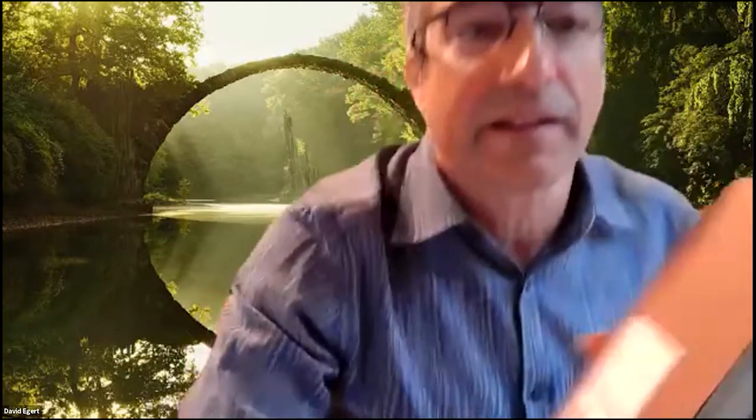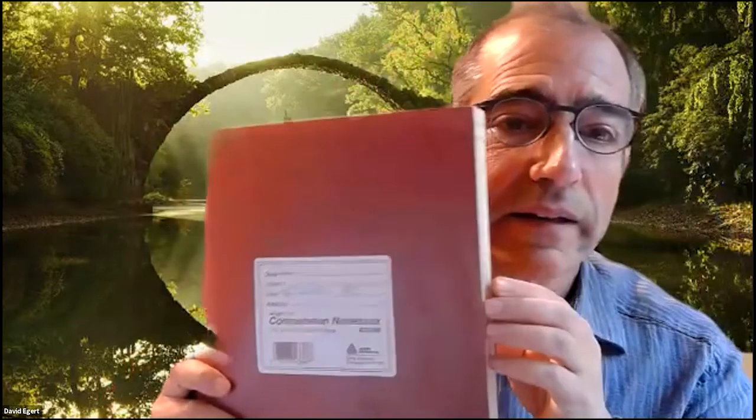All right, this is a lab notebook. This is what you all need to have. In fact, it's going to be easier if I just get rid of my virtual background, which makes things keep disappearing. So, all right, lab notebook.